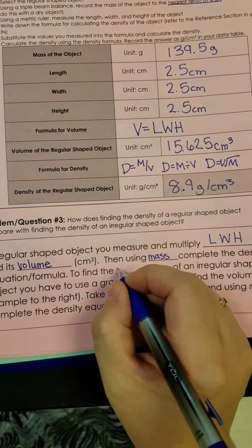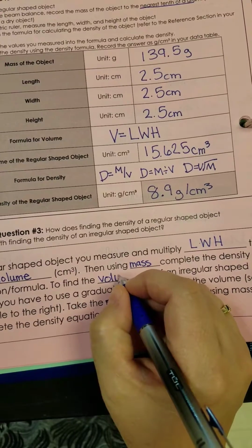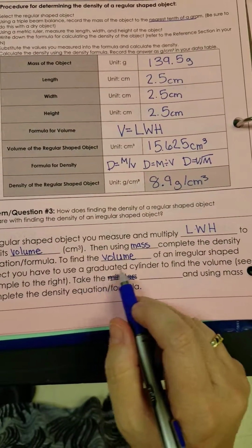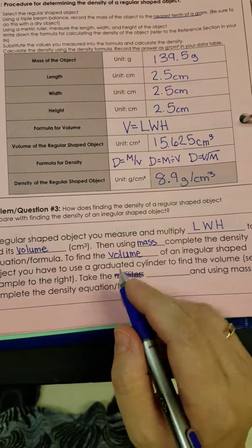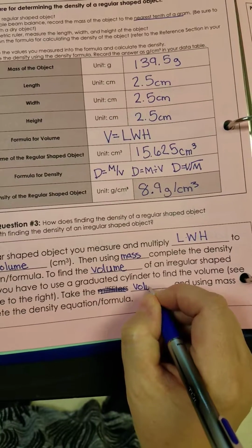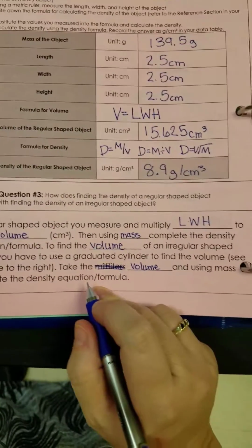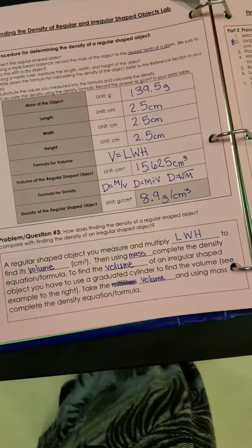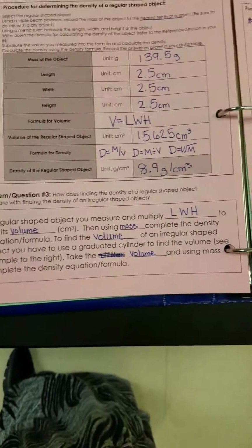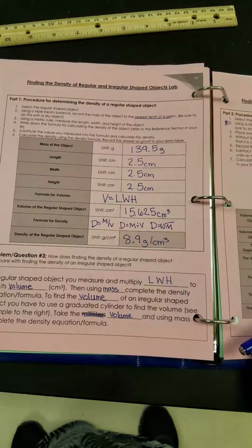Now to find the volume of the irregular object, we don't do length times width times height. We are going to take a graduated cylinder to find the volume. And then we're going to take our volume that we found, and using mass, complete the density equation. So really, we just use 2 different ways to find volume of irregular and regular objects, and use that to calculate density. This ends part 1 of Calculating Density Labs.